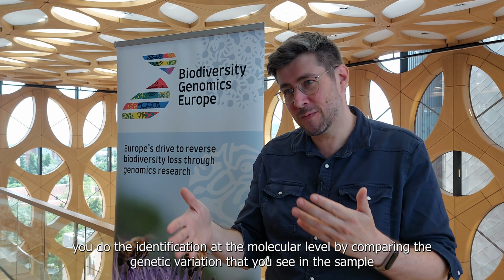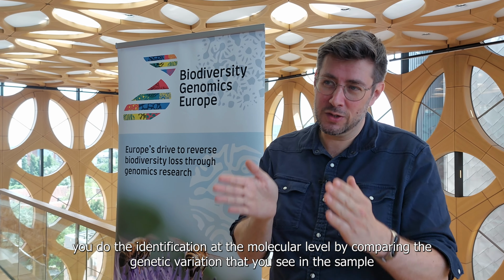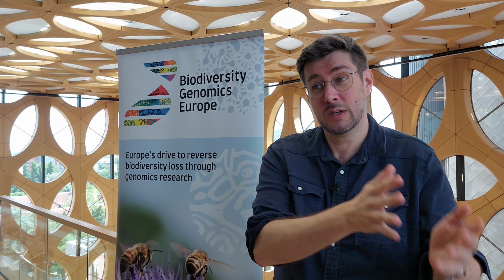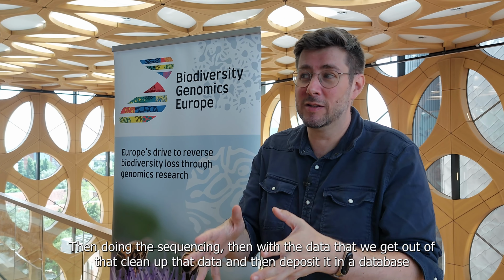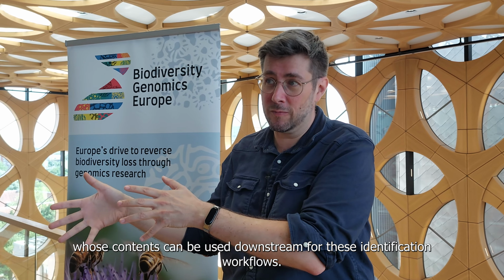Well, you do the identification at a molecular level by comparing the genetic variation that you see in the sample against the reference library. And building up that reference library is what we are heavily involved in, a whole chain that starts at selecting which museum specimens we want to sequence, then doing the sequencing, then with the data that we get out of that, clean up that data, and then deposit it in a database whose contents can be used downstream for these identification workflows.